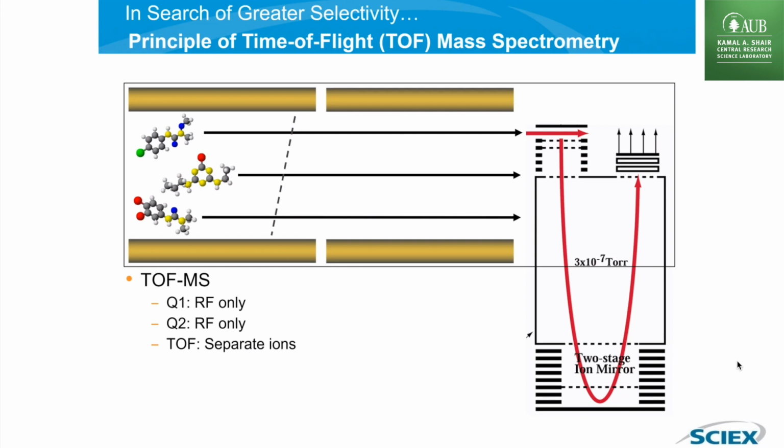Now, when we actually get to the instrument and we start looking at the details, the scans are broken down into subsections, and there are some individual changes we can make. But on a conceptual level, there are 2 scans we can make. We can do an MS scan, which is looking for the intact compounds. Sometimes we call that a parent scan. Or we can look for an MSMS scan, and in an MSMS scan in the instrument, we actually physically break the molecules and we look at those. We call them product ions because they are the products, or sometimes we call them the daughter ions. So we have parent ions in the MS scan and daughter ions in the MSMS scan.